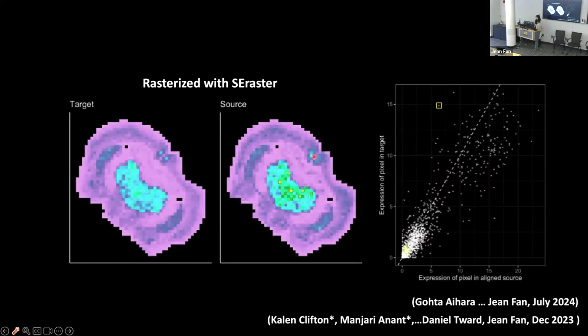There are some pixels that have high expression in this tissue section and high expression in that tissue section, represented as a scatter plot. And now we can calculate various statistics on the scatter plot representation that incorporates the magnitude similarity and the spatial information. So of course, in this case, we chose to quantify this as a cosine similarity.